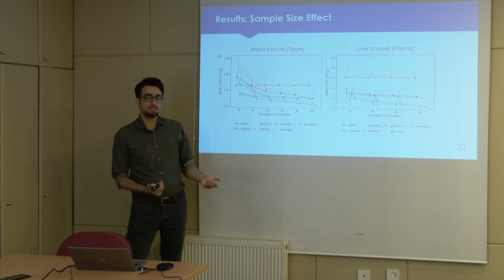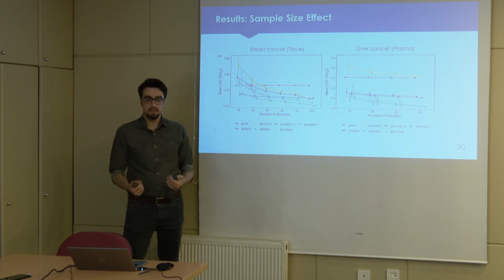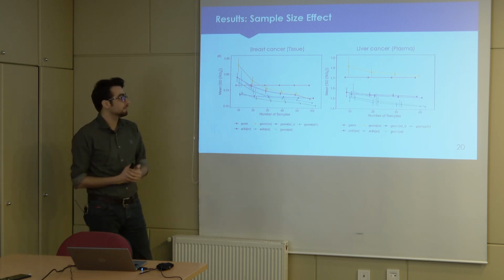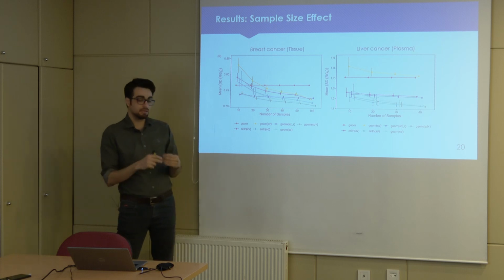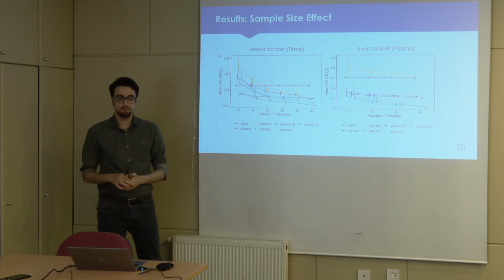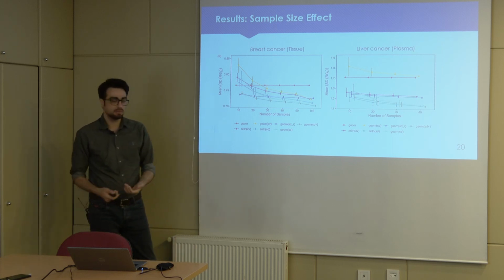Another thing that we investigated is the sample size effect. If we have a smaller number of samples, how would this affect our optimization?